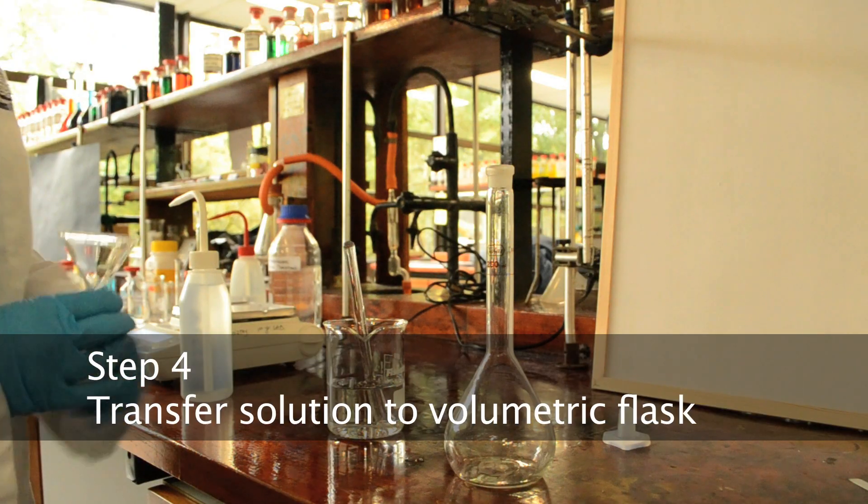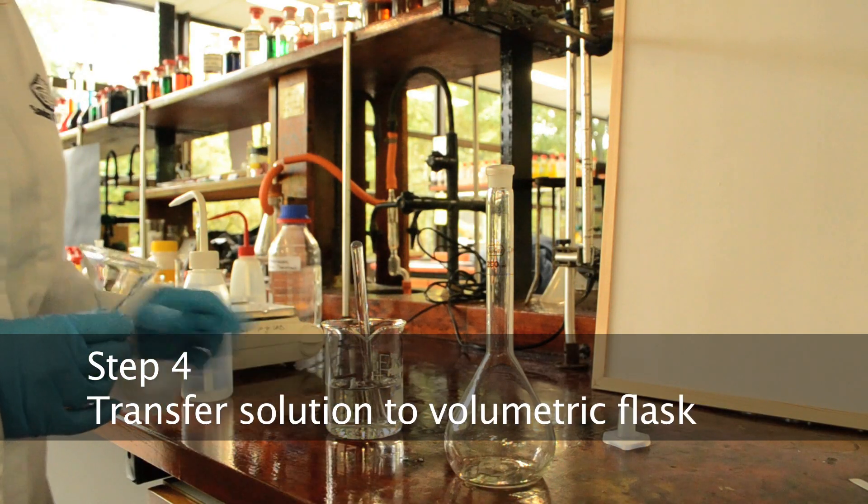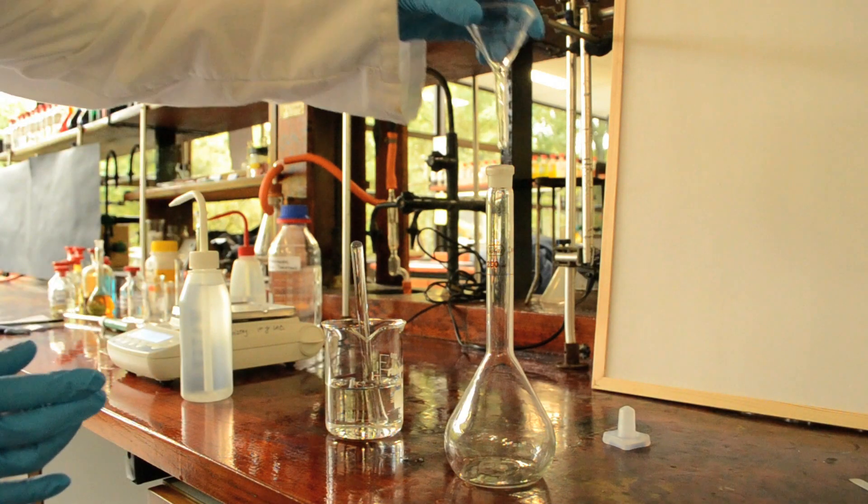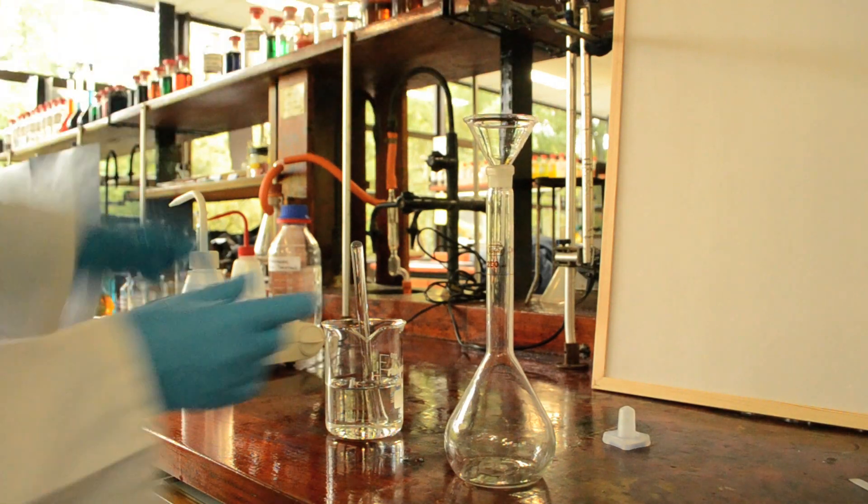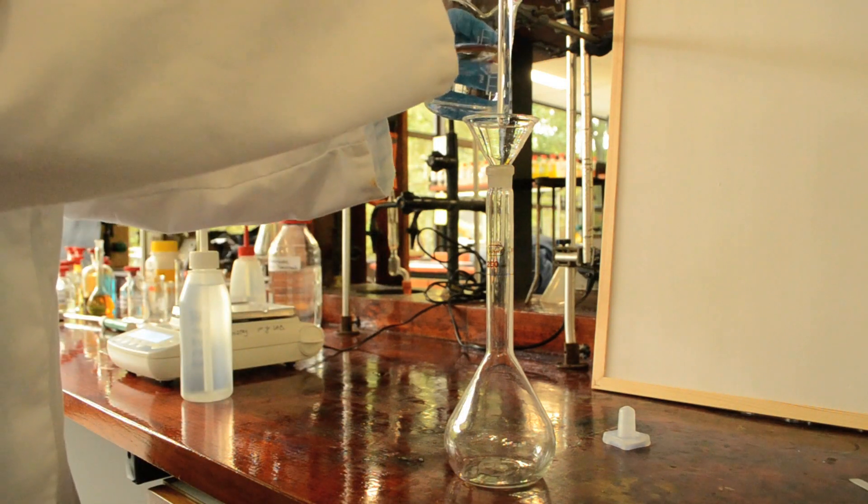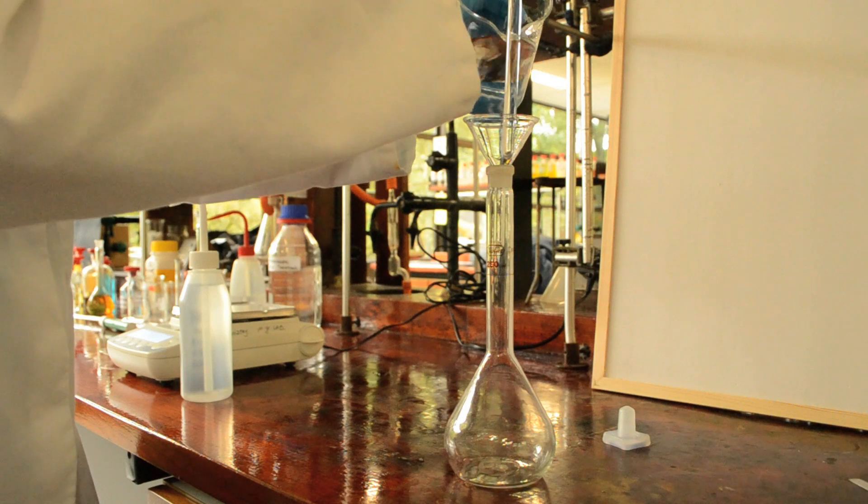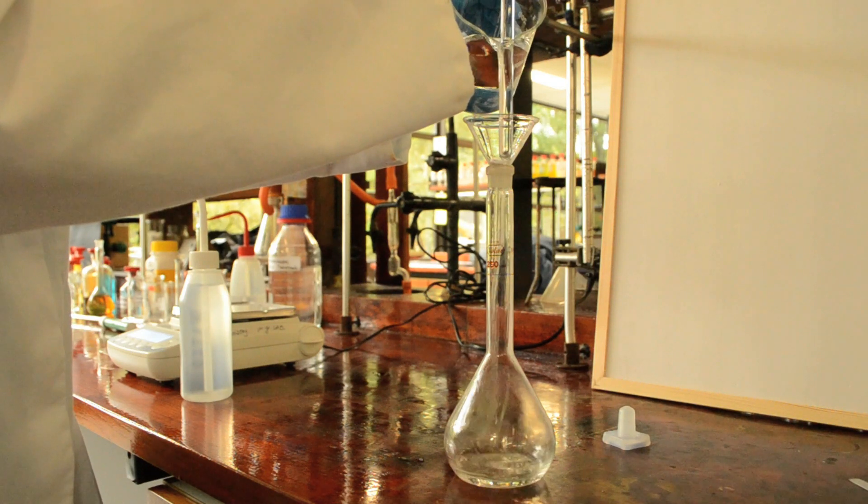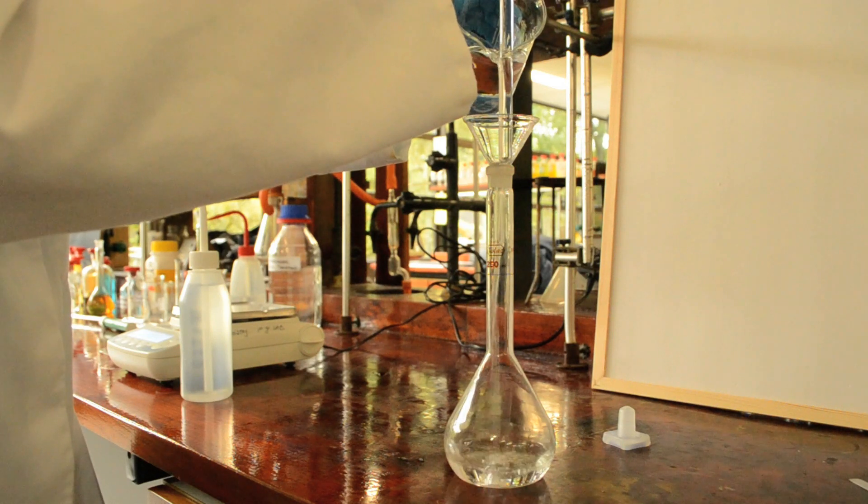I'm going to transfer my dissolved solution of sodium carbonate into a 250 ml volumetric flask. To do this, I use a funnel and I'm also going to use my glass stirring rod. This helps to prevent spillages. So slowly transferring, ensuring all of the solution makes its way into the volumetric flask.